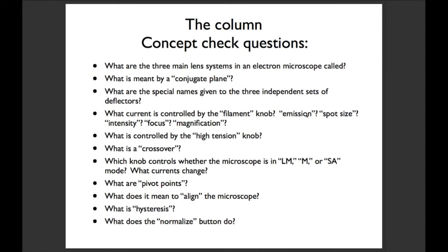Okay. I had a quick addition to that. Something that Laura and I found out thanks to Bill, one of our scientists here. The hysteresis gets introduced when you change the amount of current going through the lens system. The temperature changes, so the resistivity of the wiring changes. Bill was telling us that on the Cryos, and he thinks it's just an FEI thing, the company that manufactures Cryos, they change the magnetic field instead of varying the amount of current in the lens system.